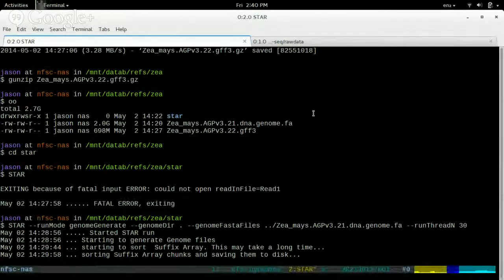Or even clarifications. So this black box that's the terminal can be accessed from that email linkage after requesting an account. Right here, I'm on my laptop, but I'm remotely logged into a machine that is owned by my PI or my advisor, which is very powerful. Lots of cores, memory, space. Although it doesn't actually have to be that powerful, like most modern desktops, if you have enough free space on your hard drive. RAM is sometimes a problem, so it depends on the program. You can sometimes get by with 4 to 8 gigs, but with Star specifically, you need something more like 64 gigs or something like that.